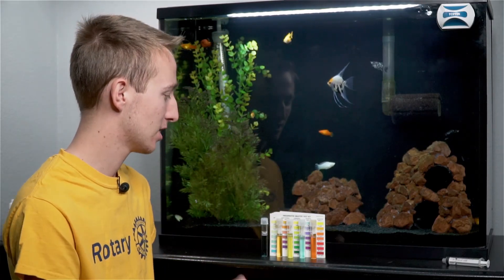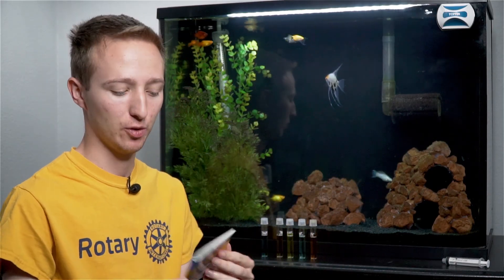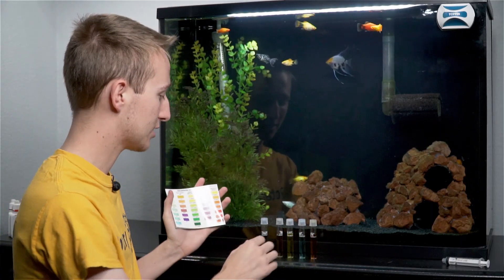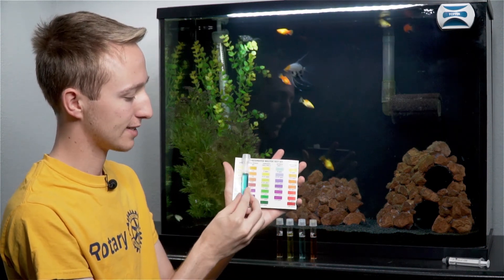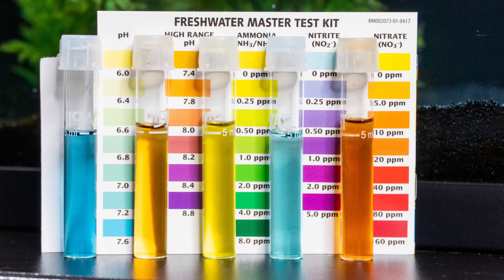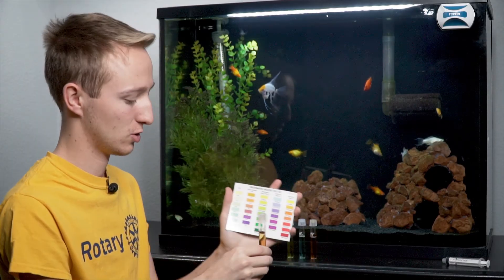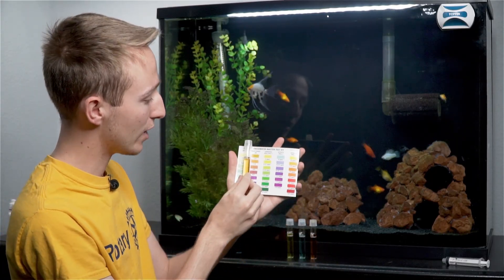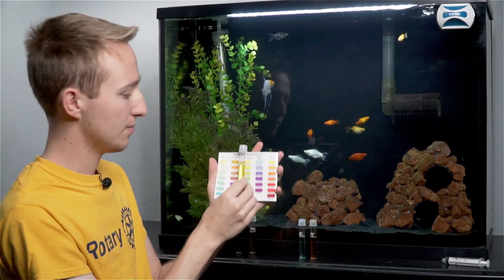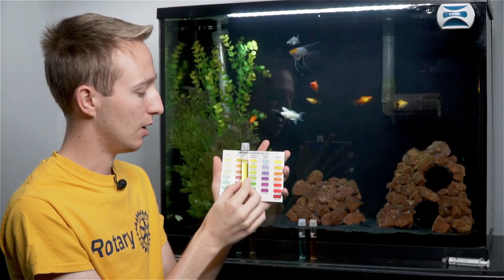So it's been five minutes for both timed tests. Now we can go ahead and hold them up to the testing chart — this is on the back of the front label and instruction booklet. I like to hold each tube up individually against something white in good lighting so you can tell the color. For the regular pH, this is reading right at about 7.6 — my water is usually about 7.4 to 7.6. For the ammonia, it's that bright yellow color, which means you have no ammonia in the tank — that's what you want.